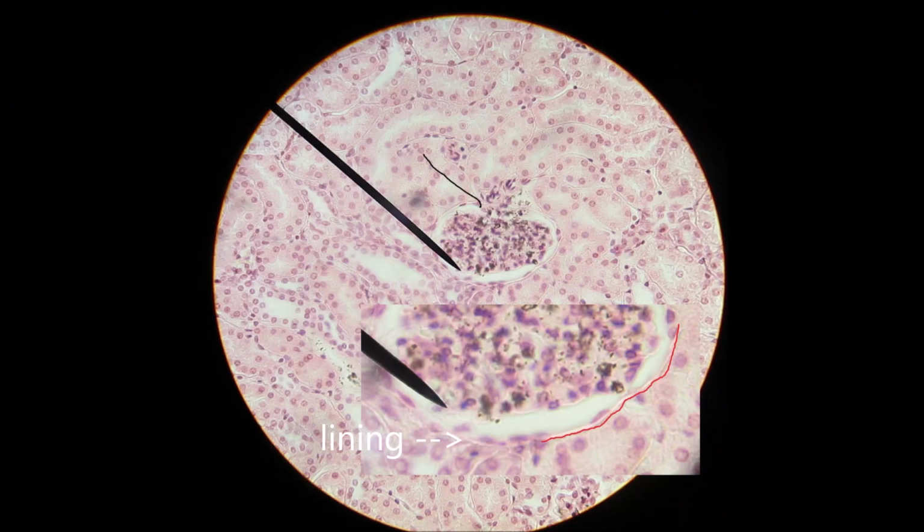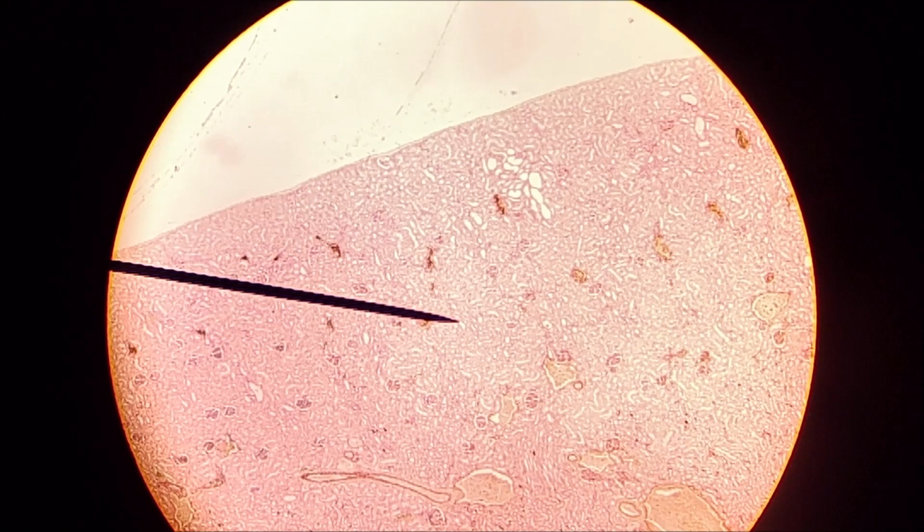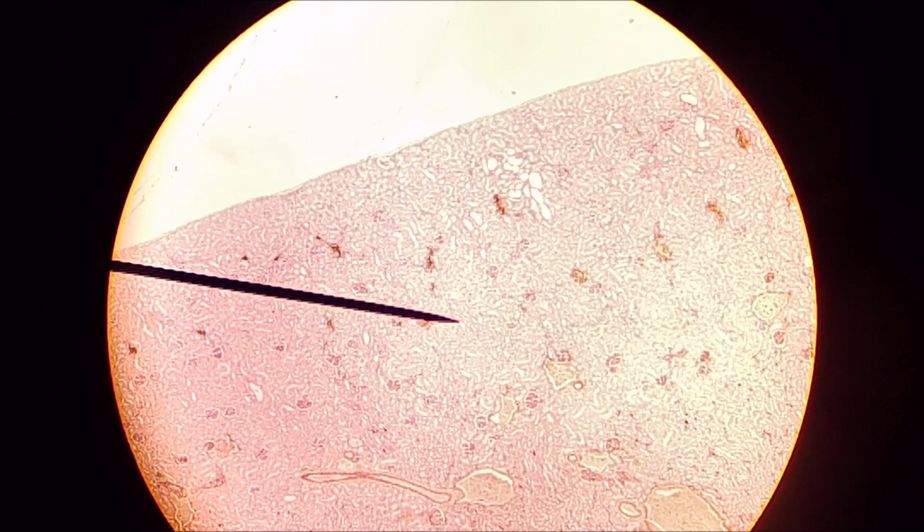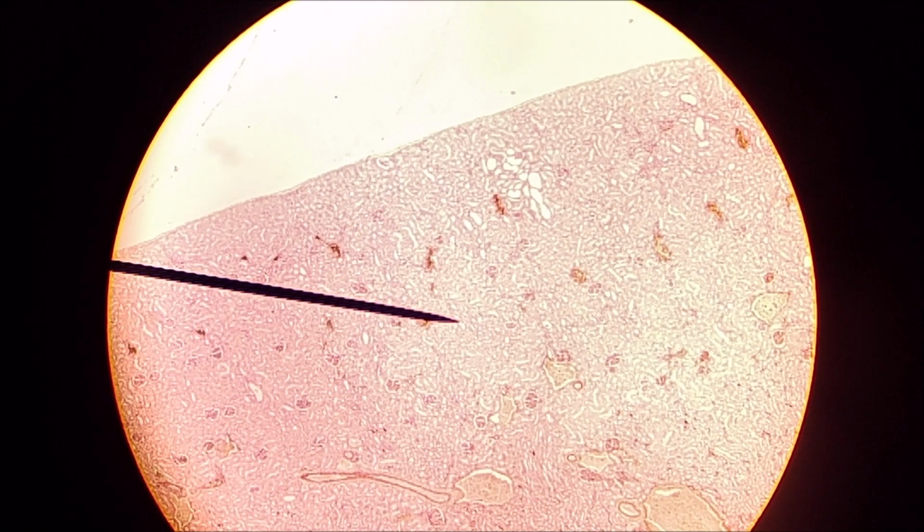What we have here is the kidney, and we're going to be looking at the simple cuboidal epithelium. Now, you can still see glomeruli all over the place. Right? There are glomeruli, all these little black spots, these are all glomeruli. But everything around the glomerulus, those are kidney tubules, parts of the nephron's filtrative apparatus. And what we're going to look at are those tubules. Specifically, we're going to look at a collecting duct, if you want to go and look up what that is.